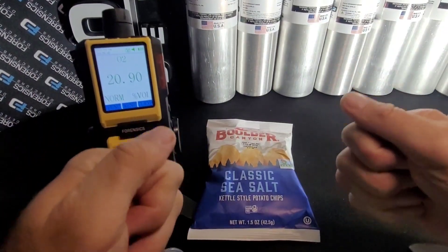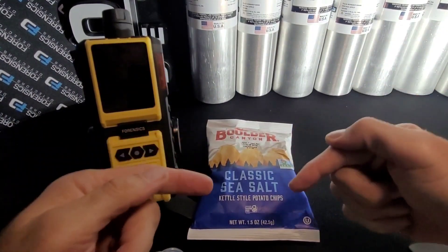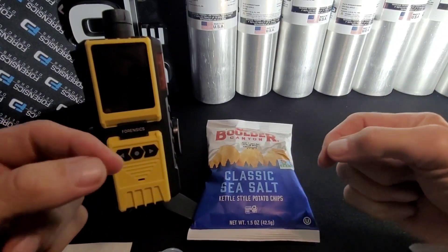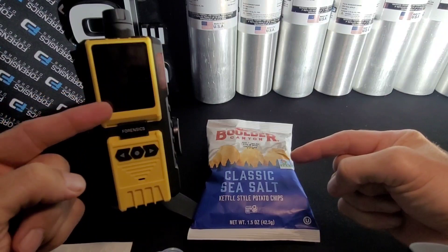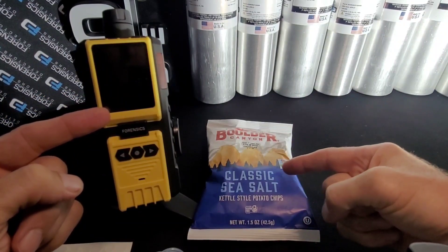Welcome to another study, another key study, another demonstration, another tutorial to help you with our Headspace Analyzers. This is our FD-600-Oxygen Analyzer, and we're going to be testing a bag of potato chips.